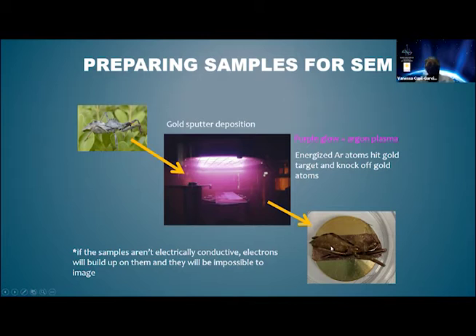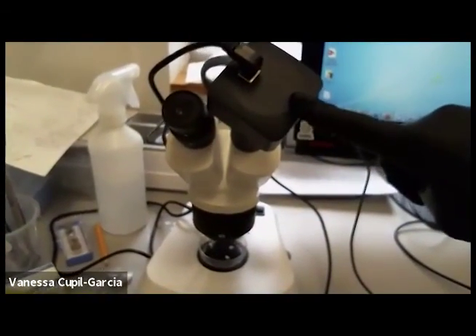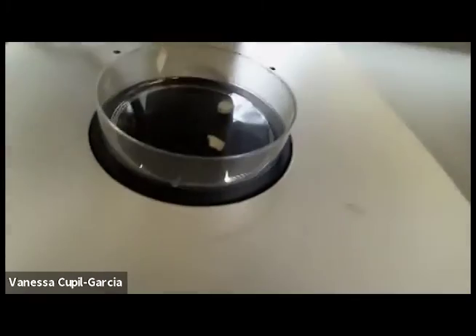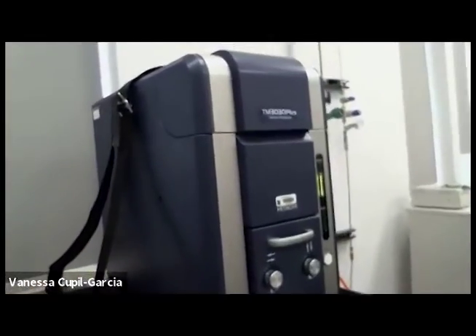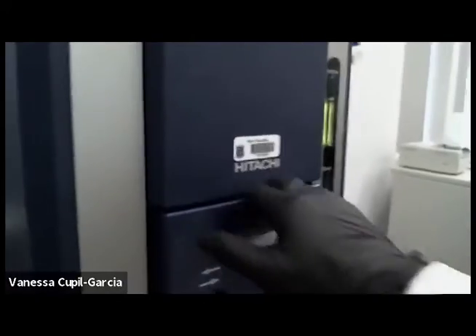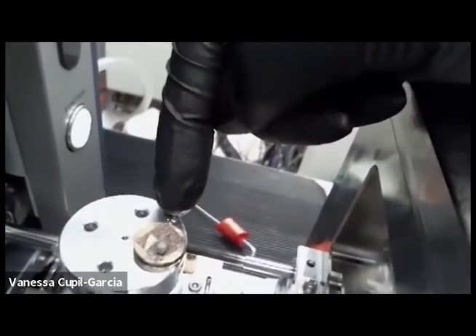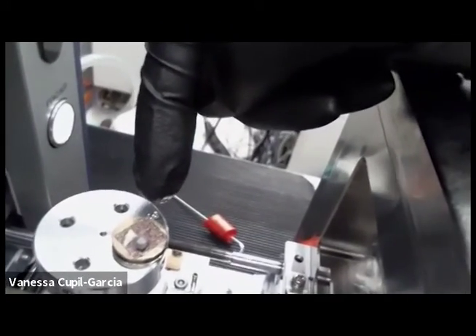So then the sample is coated in gold. And I've actually already coated our samples for today. So I will show you what our samples look like before coating and after coating, and I'll show you the two microscopes we'll be working with. So this right here is our light microscope. Here are our three samples. And we're going to turn on the light microscope so we can see. And over here we have our scanning electron microscope. It's this blue machine. And our samples are inside of this chamber. And our samples are on top of this disc right here. And you can see that they are coated in gold already.